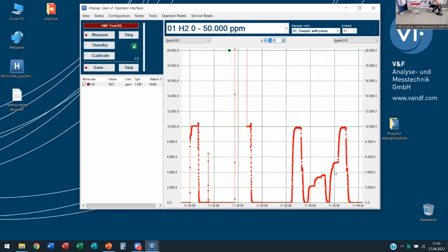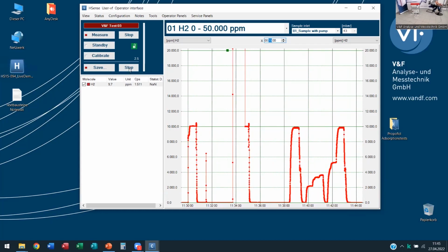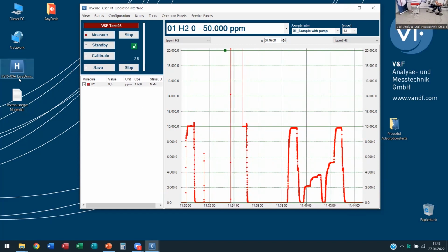Since this small chamber demonstration is now over, we can also have a look at the signals that we have just saved. Might be interesting to some. So we're going to stop this saving process. We see here the red light is still on, so we're going to stop that. Now it's turned to white again.